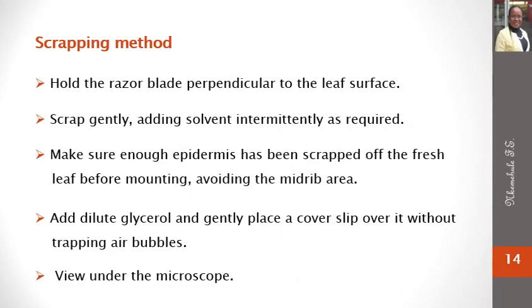The epidermis of the leaf can be scraped with the aid of a razor blade held perpendicular to the leaf surface. In this case, you scrape gently, adding solvent intermittently as required until you have enough clear epidermis, but make sure to avoid the midrib area.